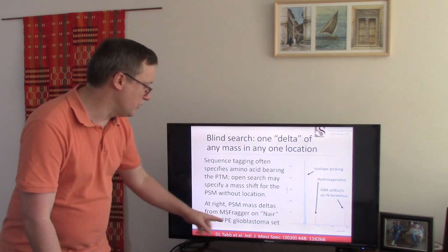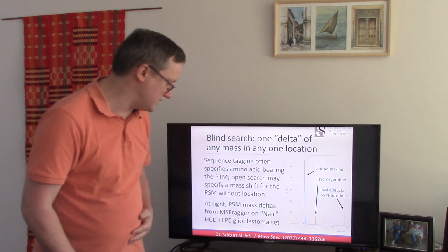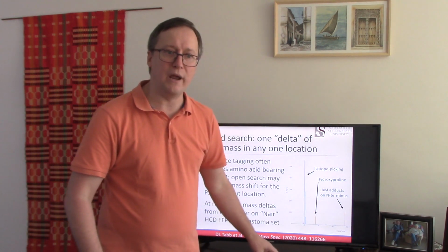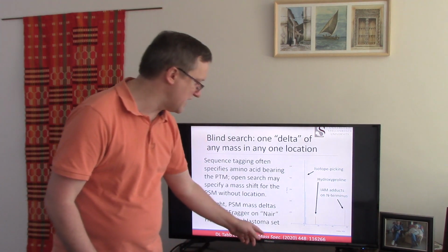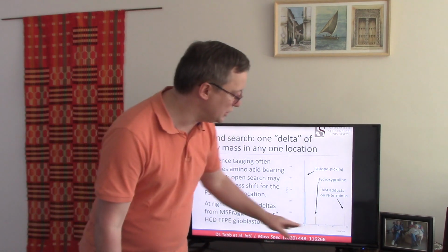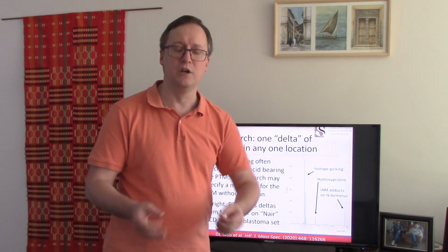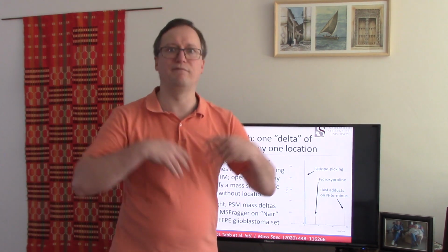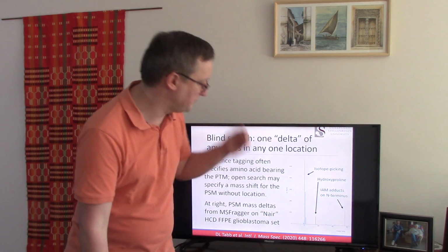Okay? So at the right, I'm showing one of these mass shift graphs that have resulted from, in this case, a formalin-fixed paraffin-embedded sample. This was one from the Nair dataset that appears in a paper of ours from this year, actually. So we're looking at the direct result of the delta mass HTML document produced by Philosopher, by FragPipe, having launched Philosopher on a bunch of MSFragger IDs.